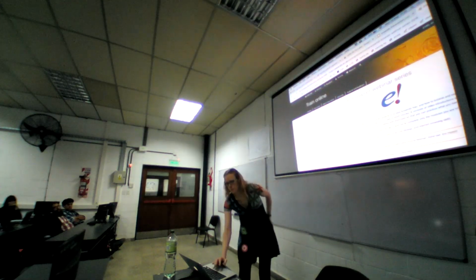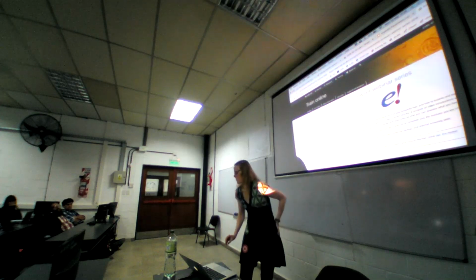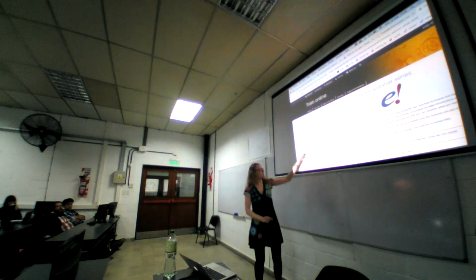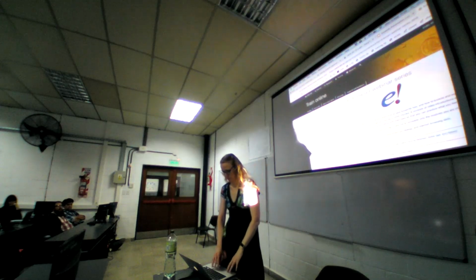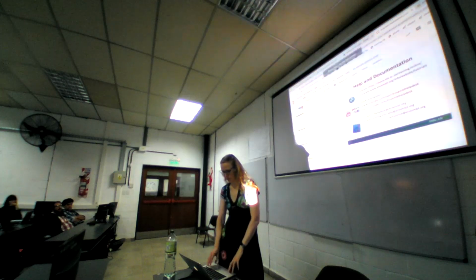We have today done all of this. We have not done regulation, which you can find here. We have not done data upload and the REST API either. So this is where you can continue to learn yourself. So have a look at that.